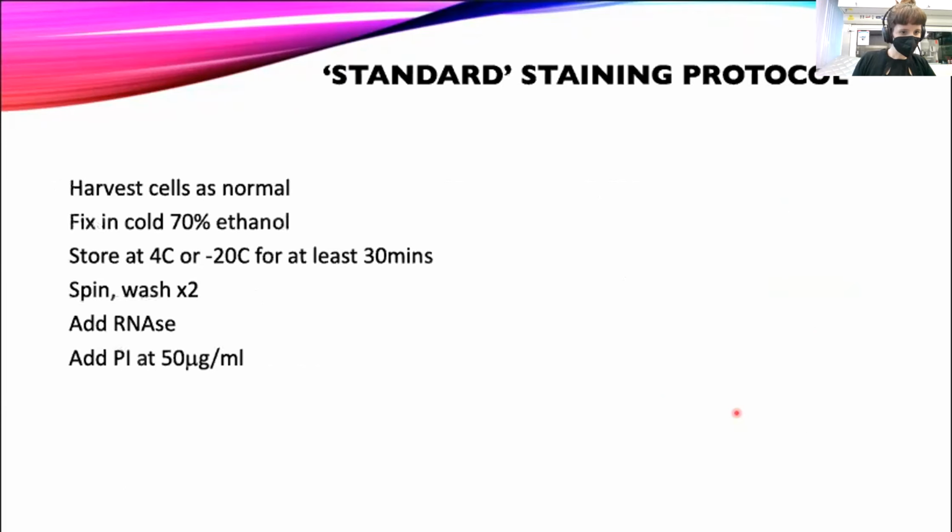Sounds good. Okay, so one of the reasons I like DNA analysis is it's quick and it's easy. And if you're using mammalian cells, I can give you a protocol that will pretty much work for most mammalian cells. But as usual, if you come to a new lab, you're a new PhD student, you're given a protocol, you run through it, and you get a result. What you should, of course, be doing is looking at those stages of the protocol and thinking, why am I doing that? What's the purpose of that? And this sort of 6-step protocol here for DNA analysis, if we stop and think about it, there are actually some things in the background that are important to think about.